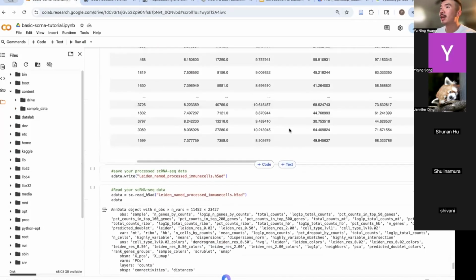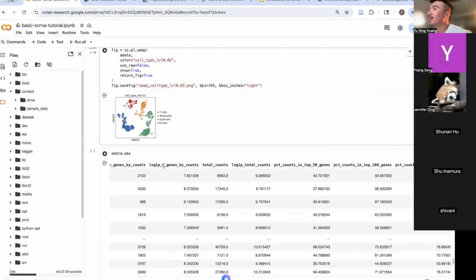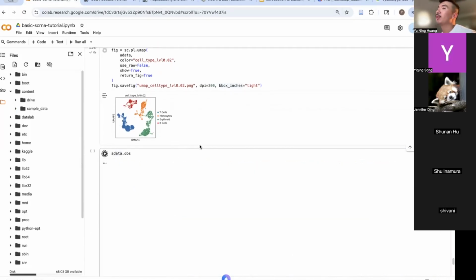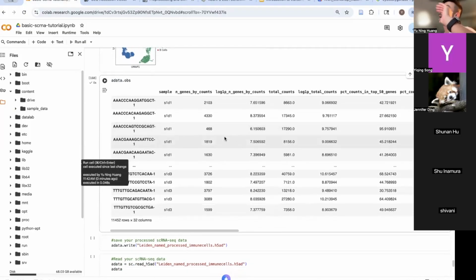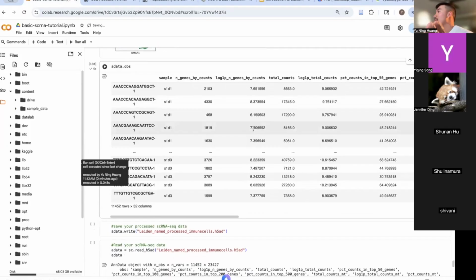Louis. And one thing to note is that in this case I created so much additional information in my adata, so I don't need to click through it every time. So I will always want to save a copy of my analysis into a new single cell RNA-seq matrix.